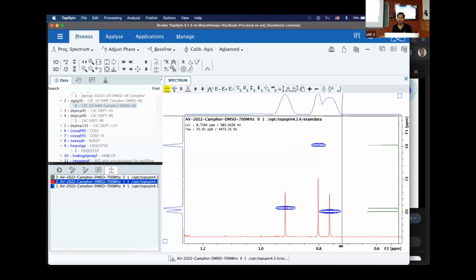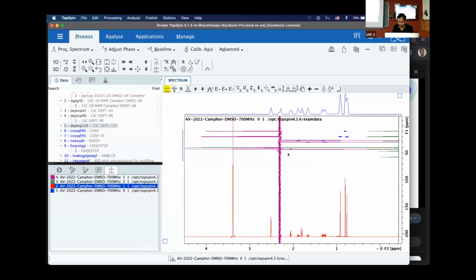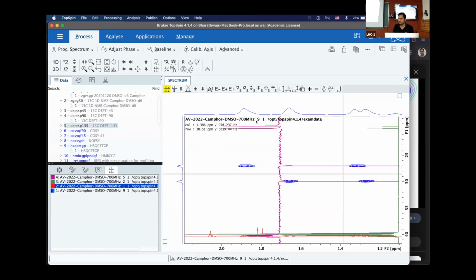This course is not working towards that. This course is trying to say how does a spectrum come. But anyway, if I give you an example, it'll help you understand why such spectra are useful. Now that we have seen these ones, let's also throw the DEPT 135 so that you appreciate what we end up getting. These were the 2 carbons which we said are CH2s.